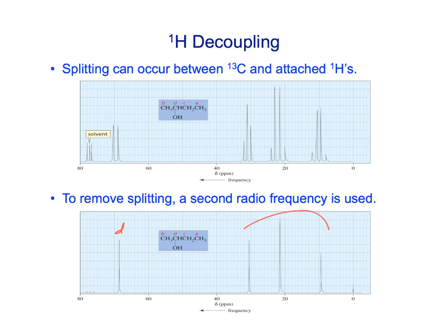If we ran a coupled spectrum, so proton coupled, each of the C13 atoms that had protons attached to them would be split by those protons in an n+1 way, like we've noticed. So for example, notice here that we see this one as a quartet. That means that there are 3 protons coupling to that carbon. So 3 + 1 gives us 4 peaks. So if you get a quartet, that means that this peak is for a methyl group. So the splitting tells us how many protons are attached directly to the carbon.